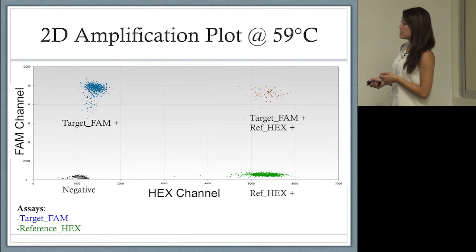The same goes for targets amplifying in the HEX channel. Then you have your double positive amplicons amplifying over here. We know our assays are well optimized because our clusters are very discrete clusters.